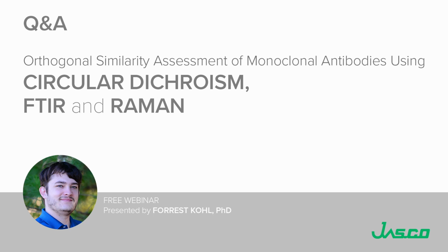There is another question here. I think I can answer that one. The file type is JWS. JWS is the spectroscopy file type for Jasco software. So yes, the file type is JWS for CD data. I think I'm looking at all the questions.